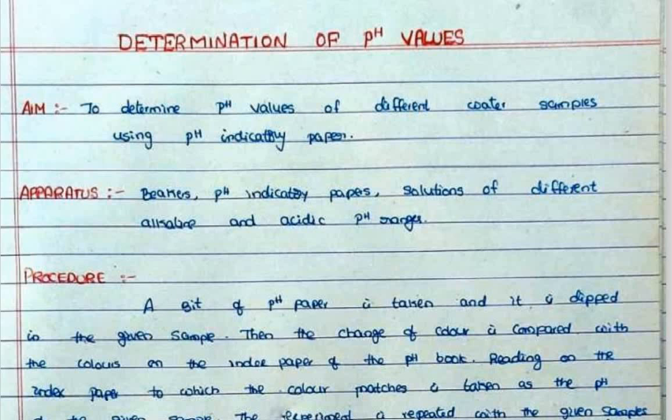Okay, so apparatus: beaker, pH indicating paper, indicator papers, solutions of different alkaline and acidic pH ranges.